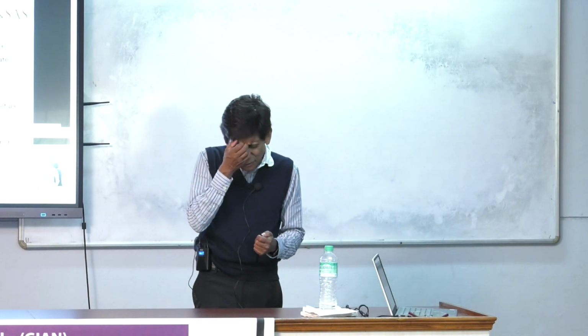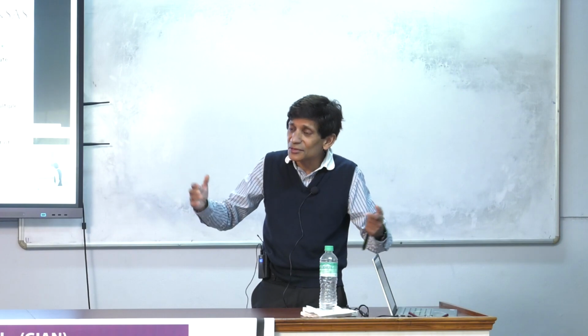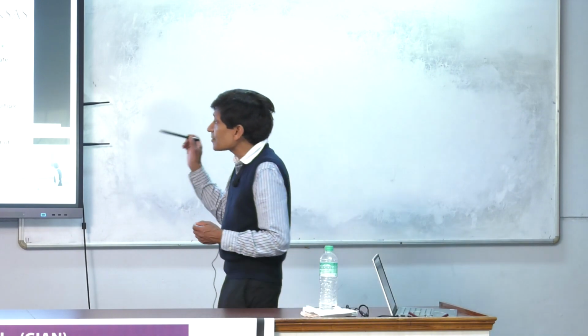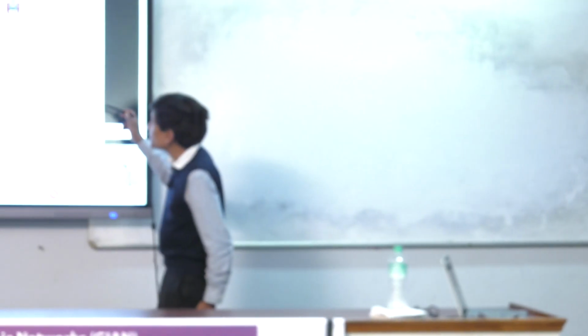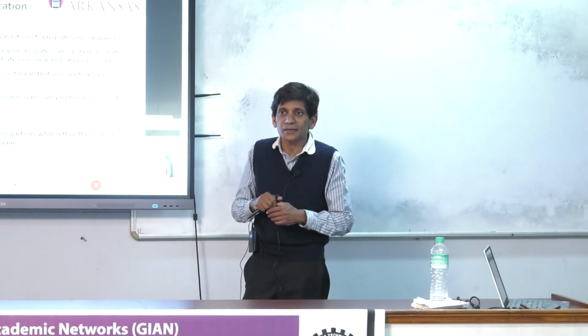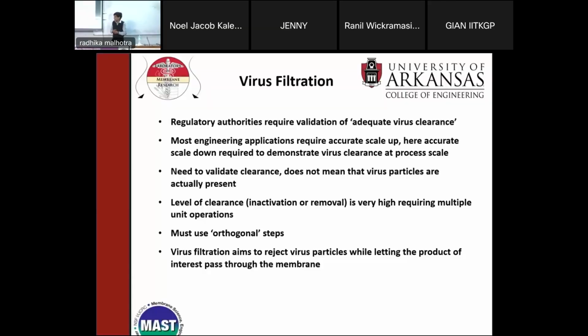No. If you had, you would know that to grow virus is quite complicated, and to grow it to that number, okay, if you want 10 to the 6 per ml, and you're talking about a 10,000 liter bioreactor, that's a huge number. You couldn't do it, okay? It's just not feasible. So you have to scale down, and this is a case where scale down is very important because a small scale unit should give the same results as the large scale, okay?